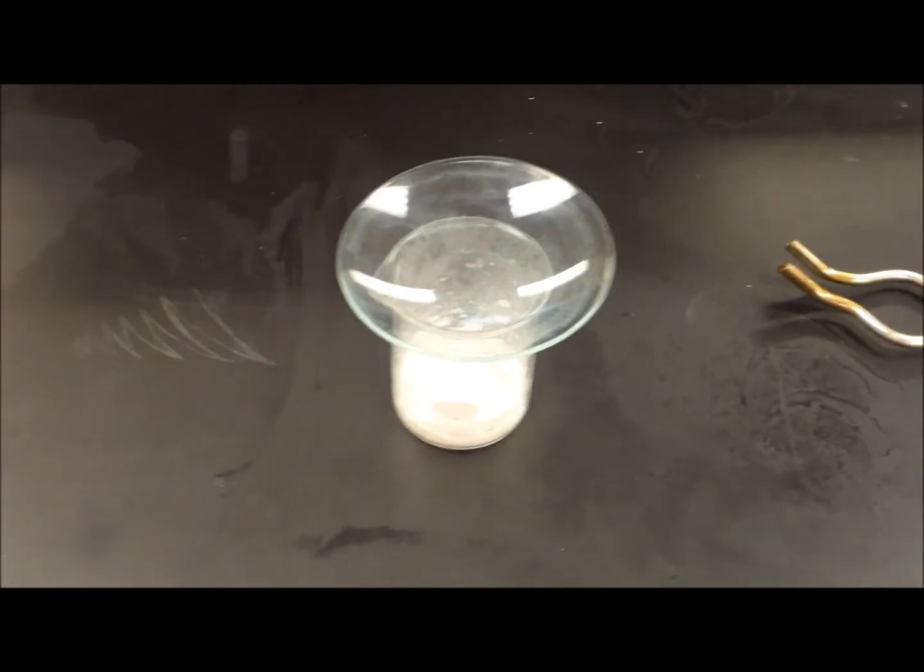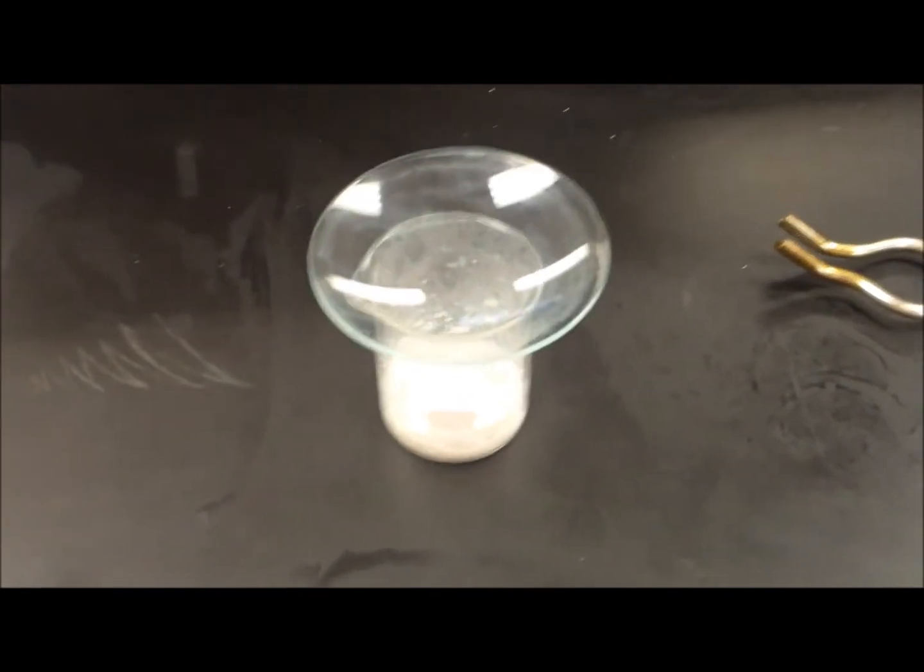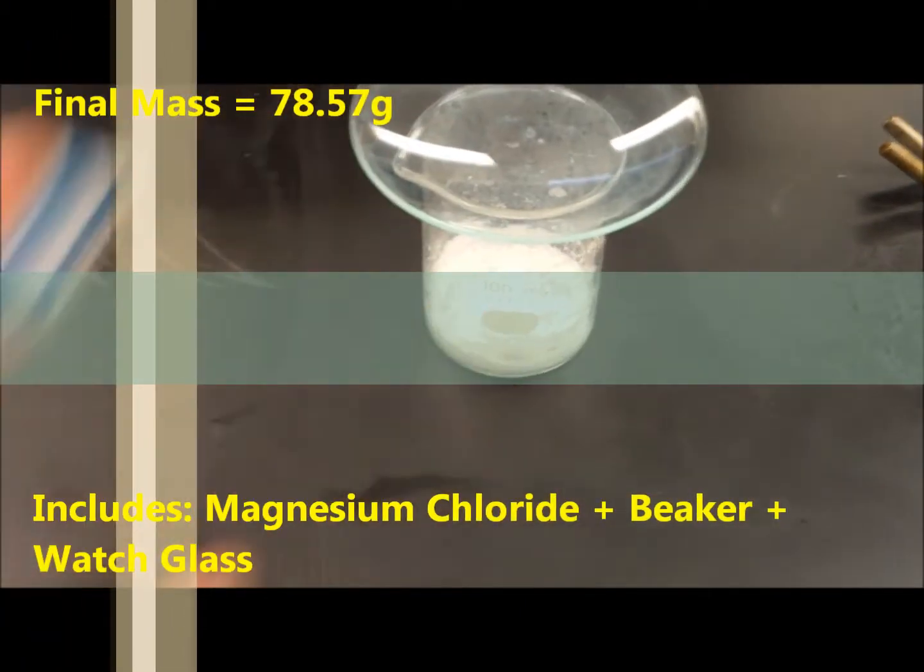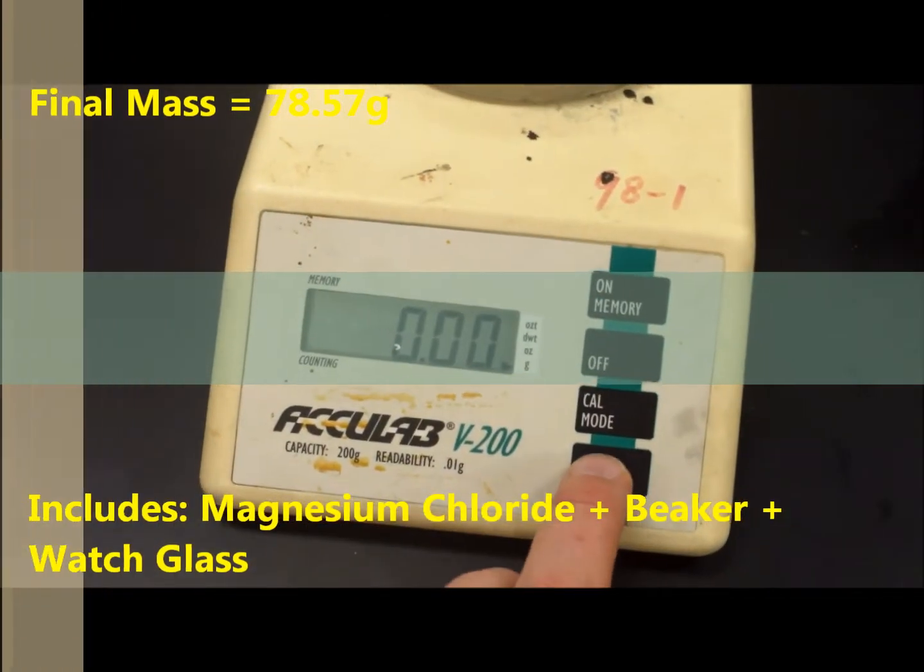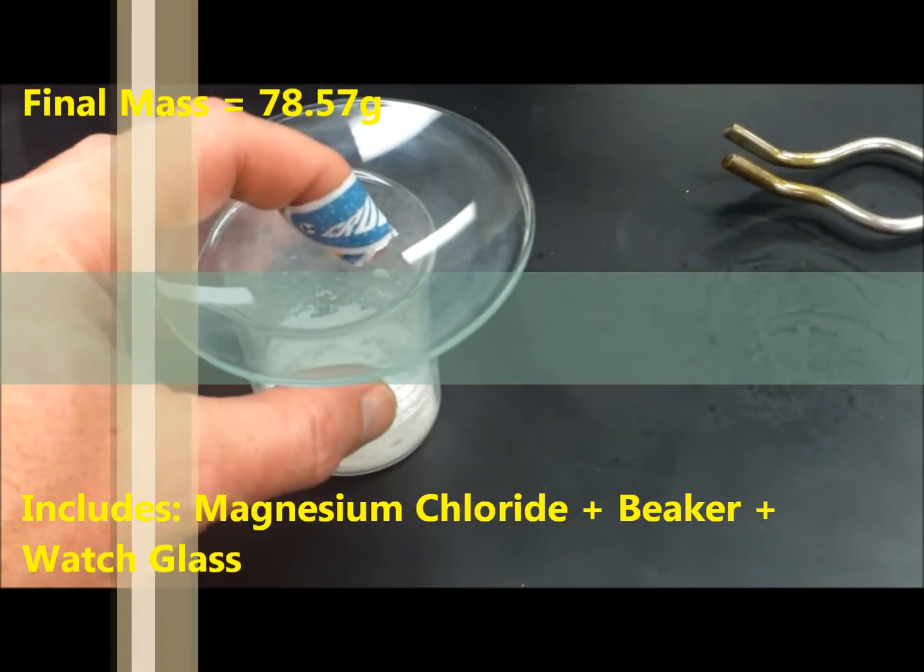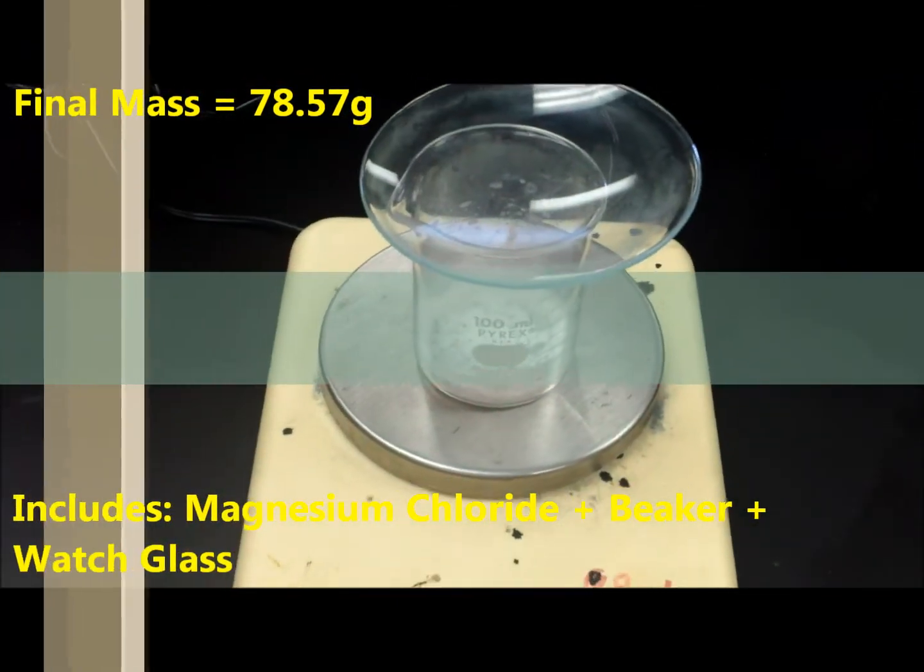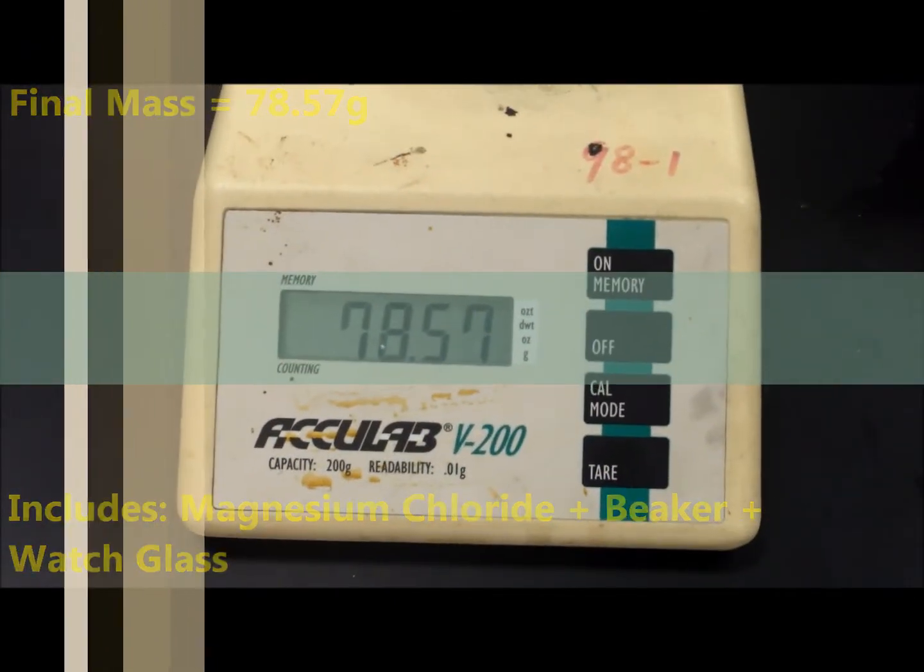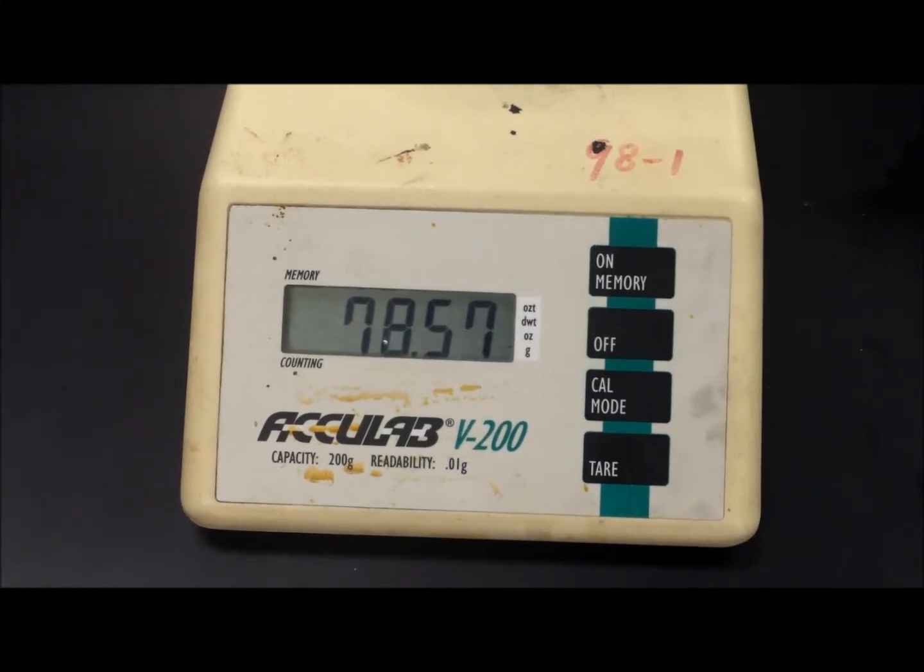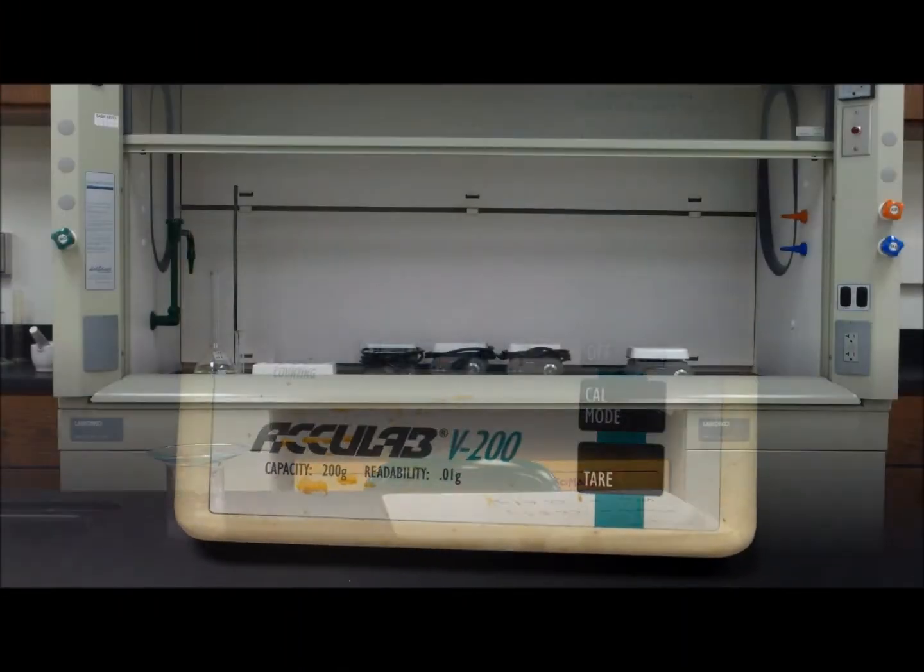All right, we're going to do one more mass measurement of our magnesium chloride sample. So let's go ahead and make sure this is zeroed. Take our sample and we're getting a mass of 78.57.